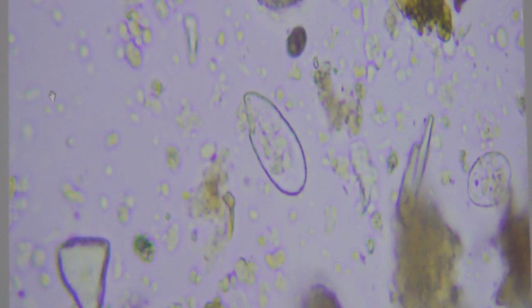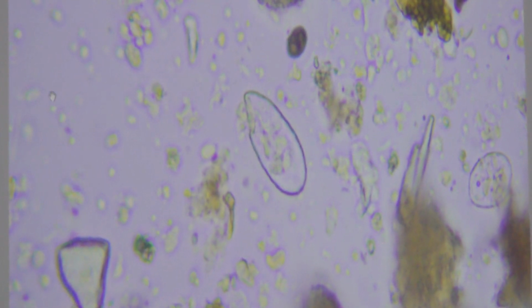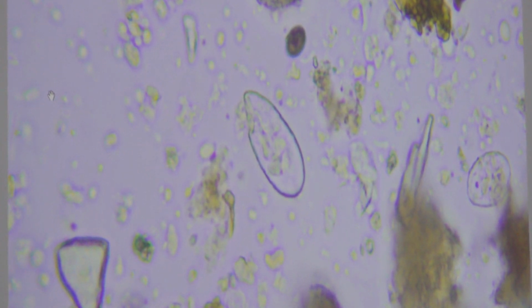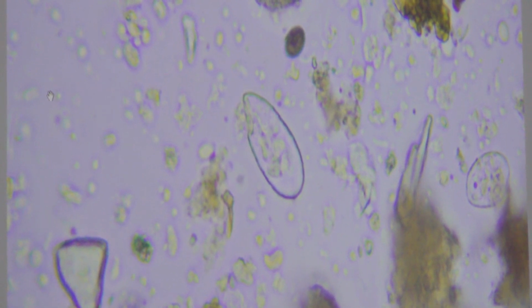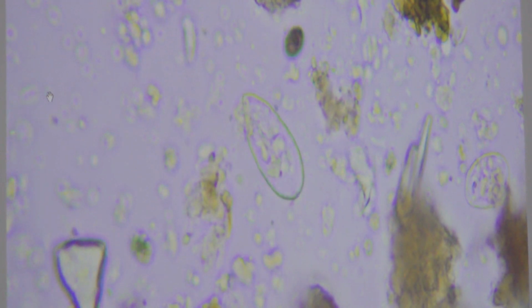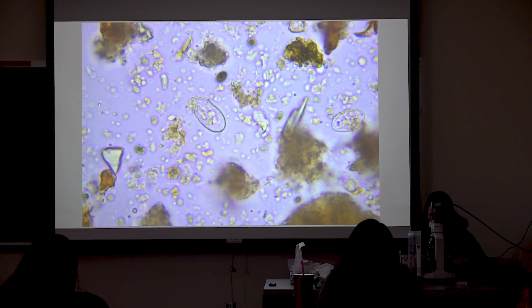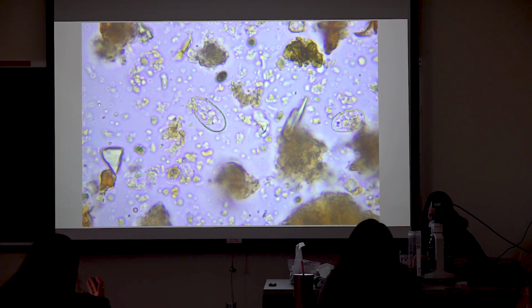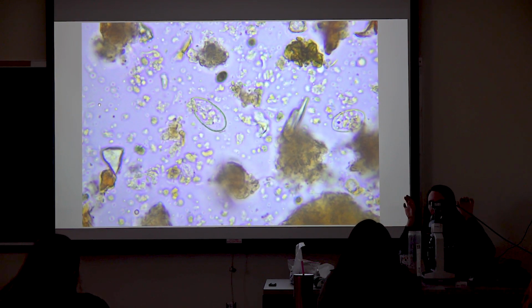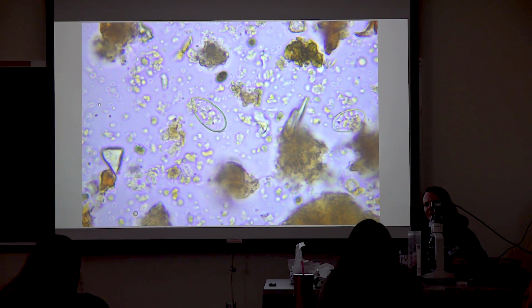So that is an amoeba creeping. So is it just coming out of the shell to eat? Yep, to move around, to eat stuff, check it out. Typically, they would spend most of their time out of the shell, grazing and moving around. Sometimes it can be hard to tell what they're doing. Usually not the whole body comes out, because it still has a little bit inside holding on to the shell so it can tote it around. So yeah, it would be like a snail.